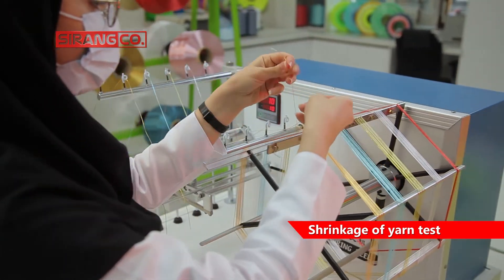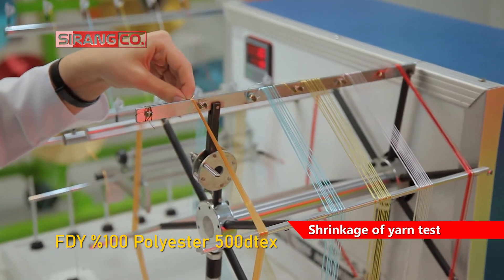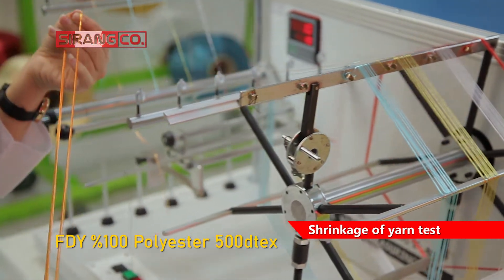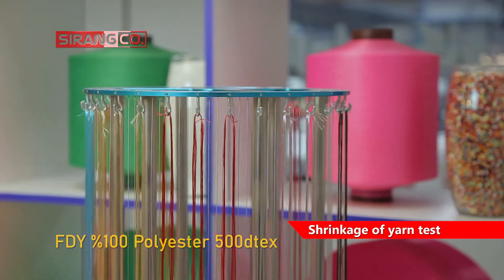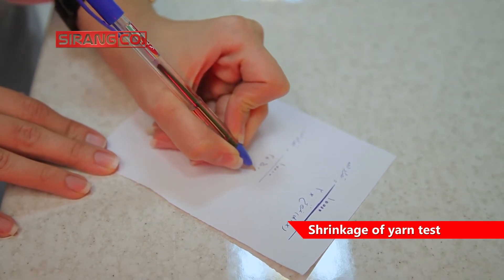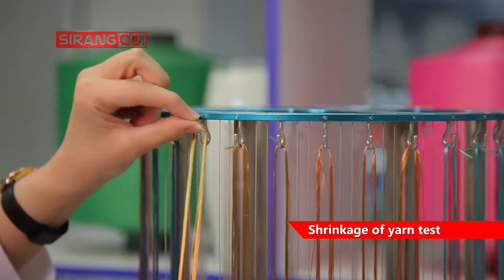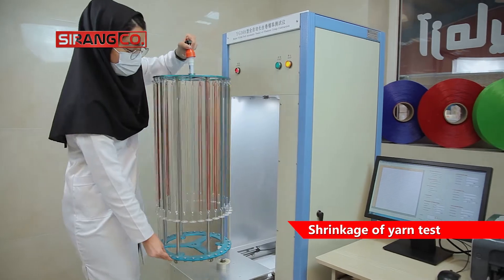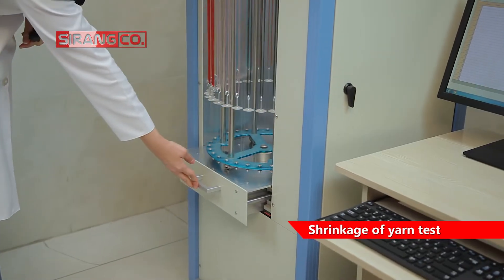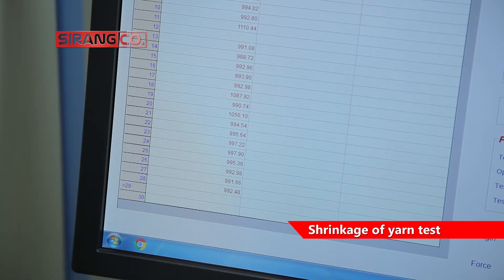For example, to determine the shrinkage of a 100% polyester FDY yarn with a linear density of 500 dtex in the form of skein, after preparing the yarn samples using the formula mentioned in the relevant standards and a wrap reel machine skeined with 10 turns, the skeins are placed on the holder and the initial length of the sample is measured using the shrinkage tester and stored in the device memory.